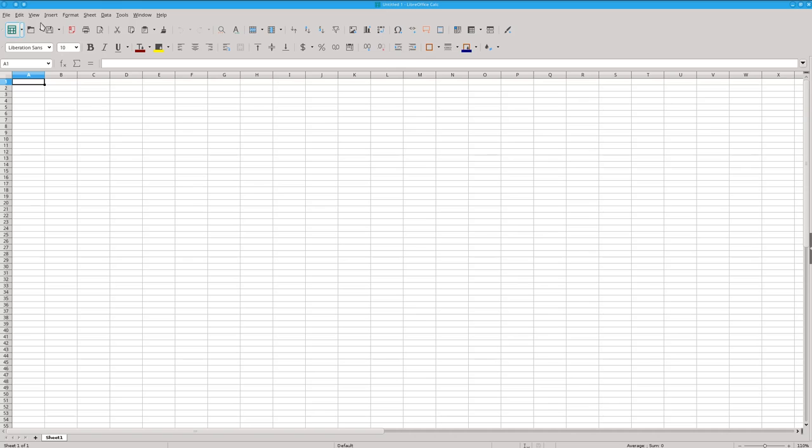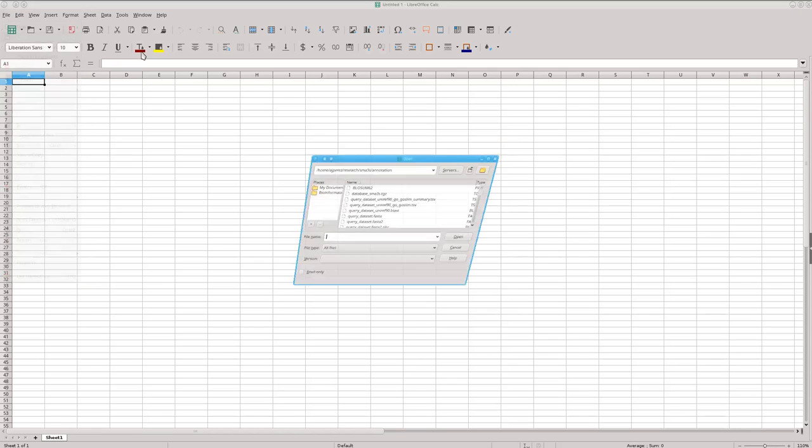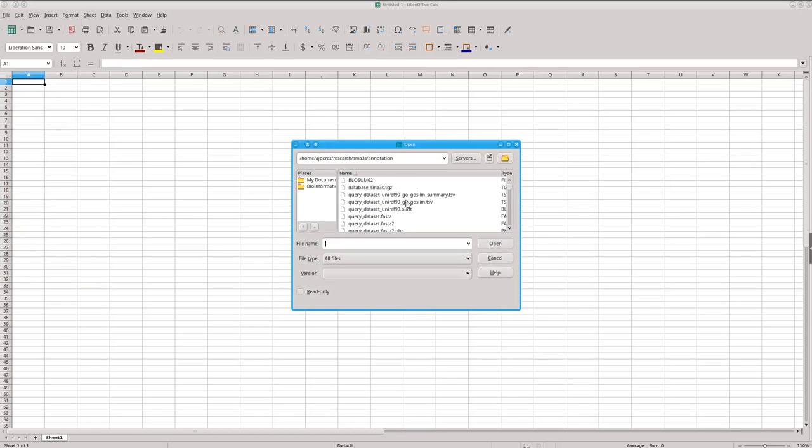And we can open, for example, this one, the annotation.